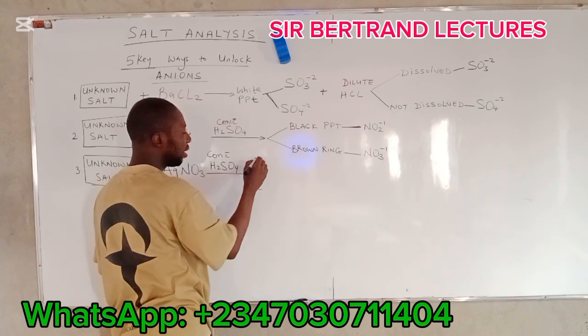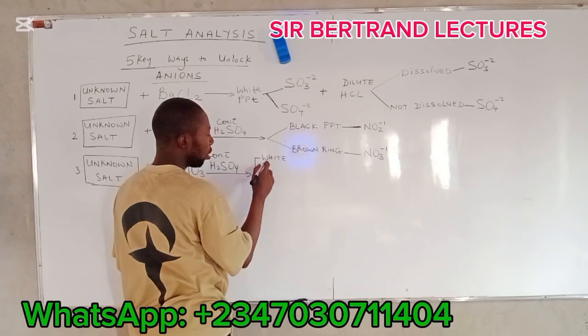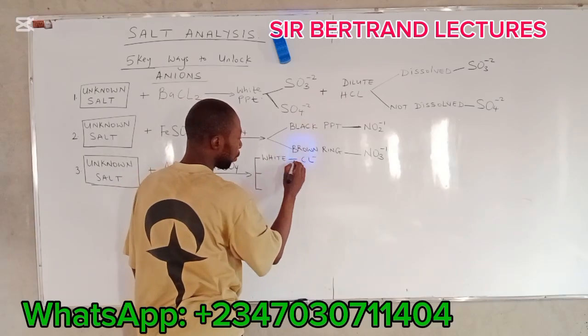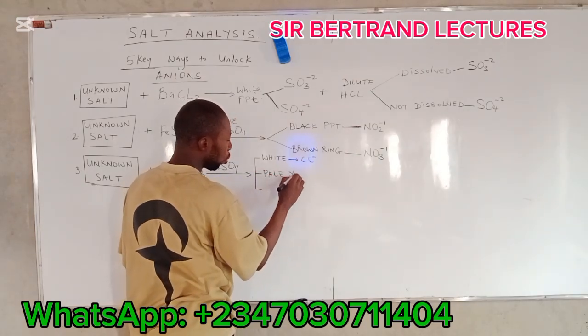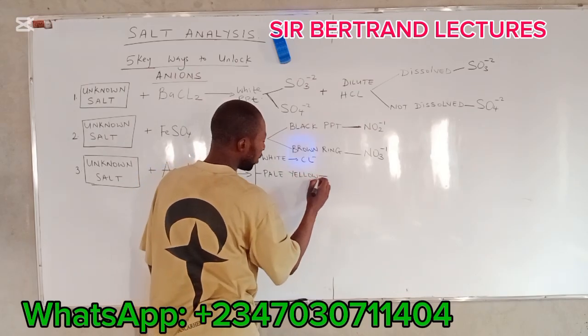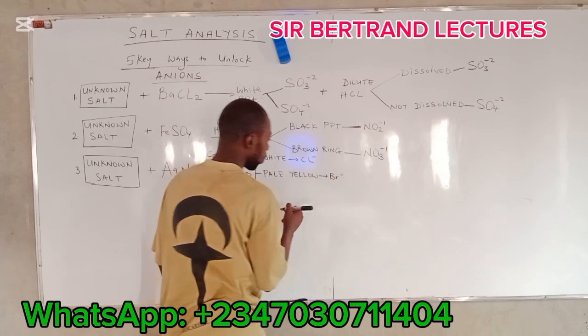If it gives white color, it indicates the presence of chloride ion. All right. Then, if it gives pale yellow color, it indicates the presence of bromide ion.